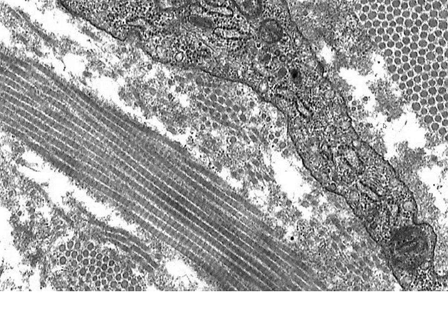Now this is one of those insets that we saw just looking below the fibroblast, and here you can see the nice periodicity of our collagens, that regular row. And unlike what we would see in our myofibrils in muscle, we don't see any alternating light and dark bands. You just see these light areas of periodicity between the collagen molecules as they're put together. And here you can see the collagen cutting cross section. Nice look at some endoplasmic reticulum, and you can see the individual ribosomes on the ER there.